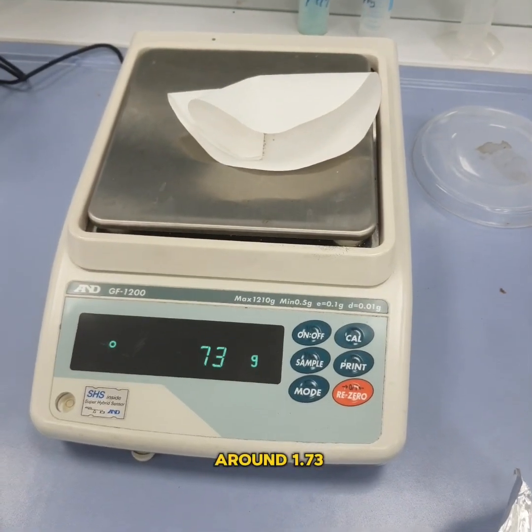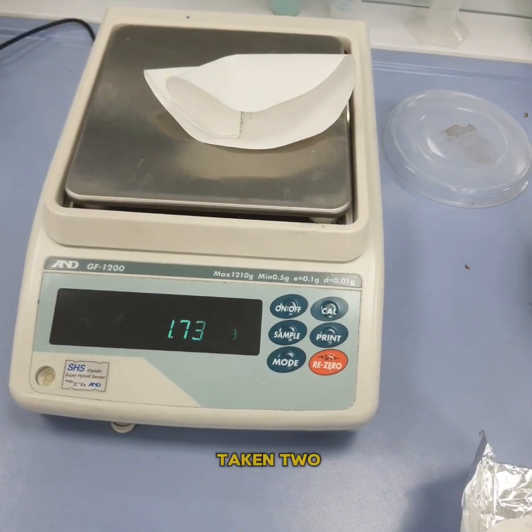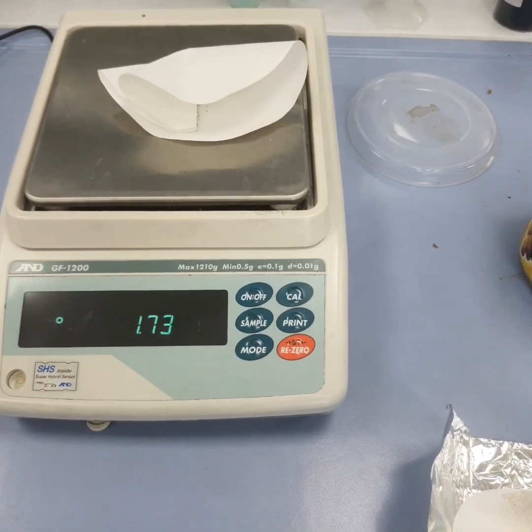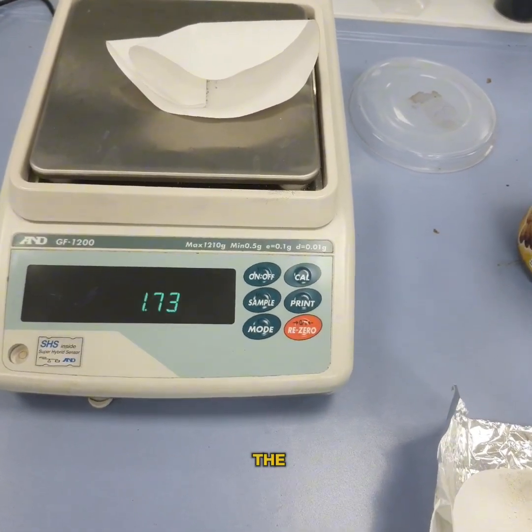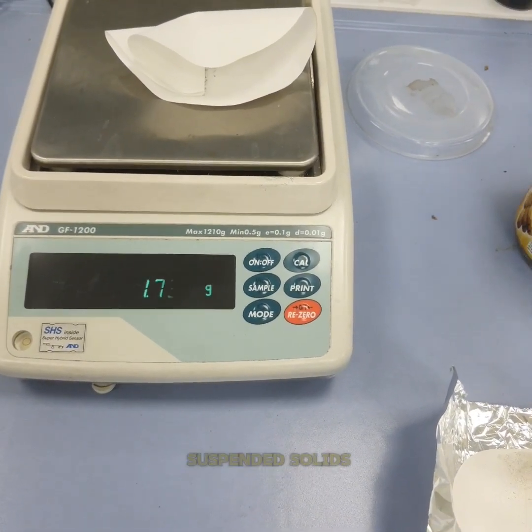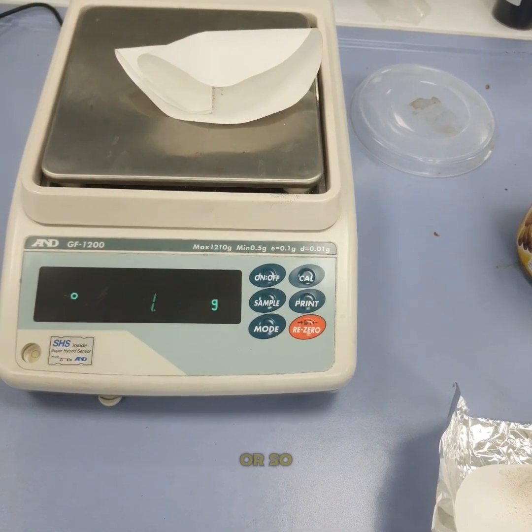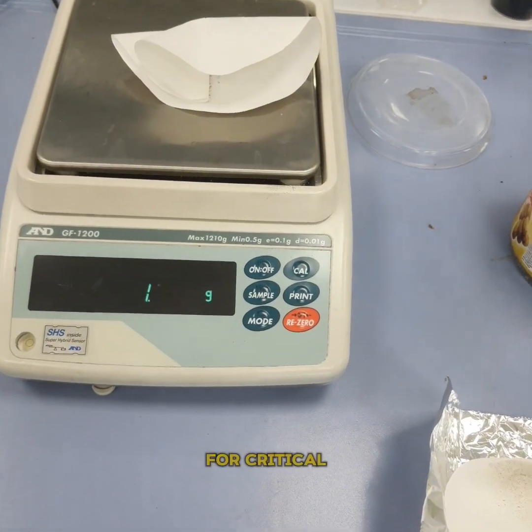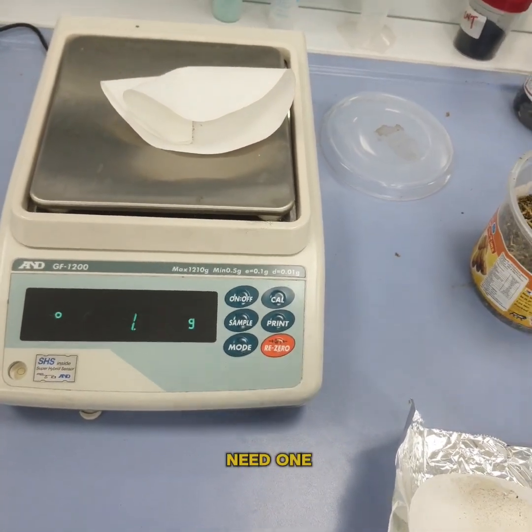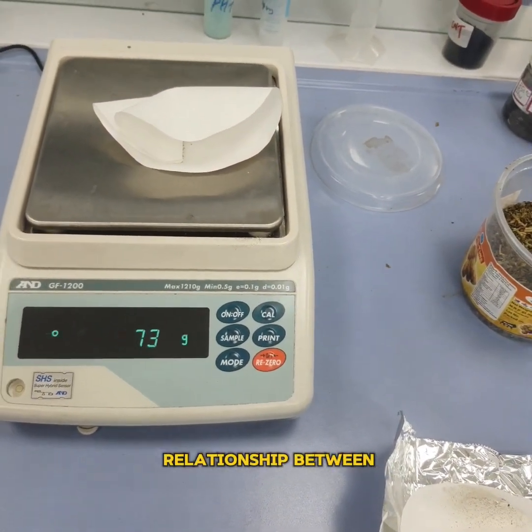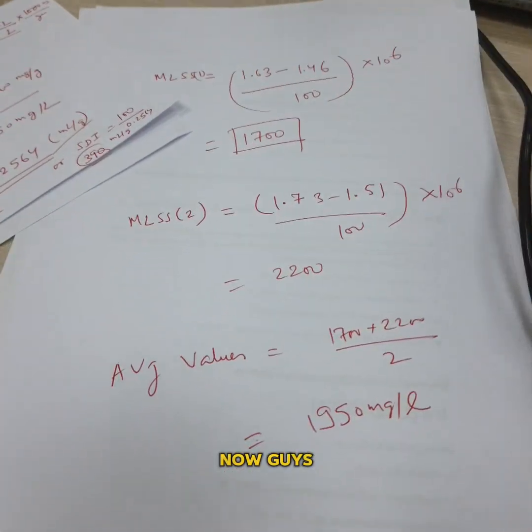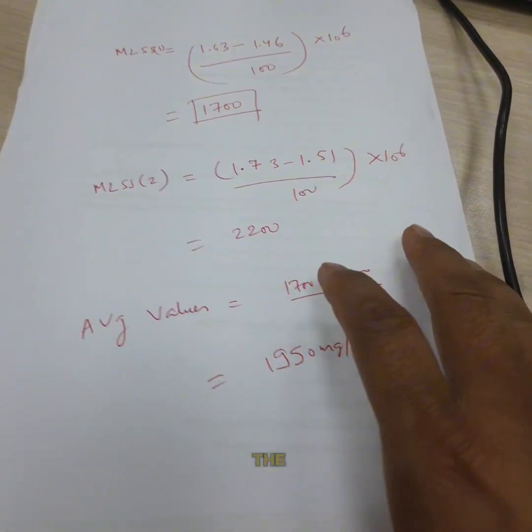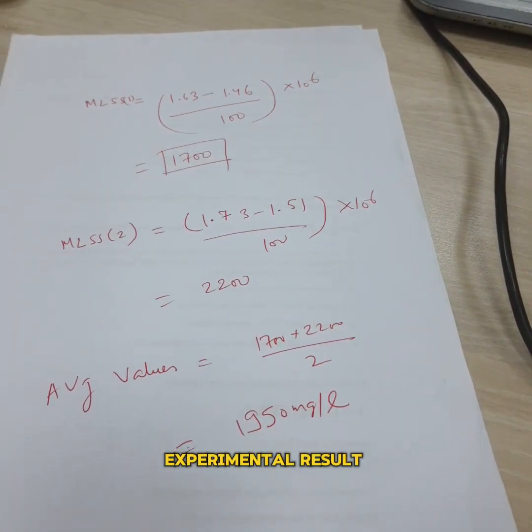The second one is around 1.73 grams. What we will do - we have taken two samples so we will take the average of both of them. And also if you want to find out the mixed liquor volatile suspended solids or MLVSS, we need to burn that. So we will skip that step because for the calculation of SVI and SDI we just need one of them, because there is a relationship between MLSS and MLVSS.